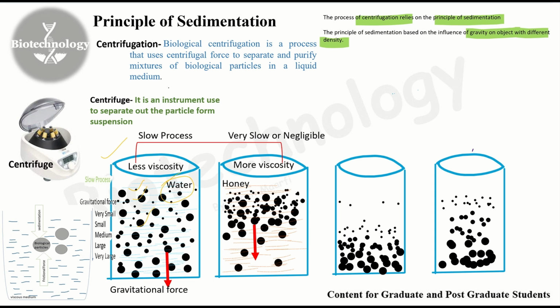So we suspend these denser particles into water contained in a container. Then these objects will experience a downward pull due to gravity.